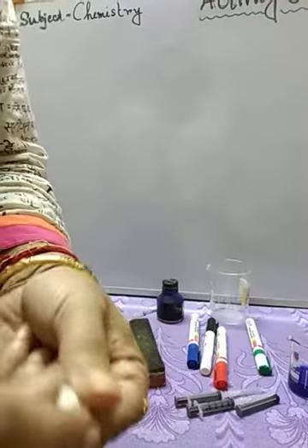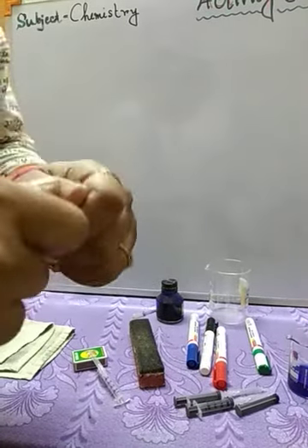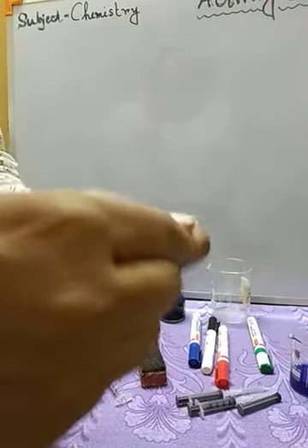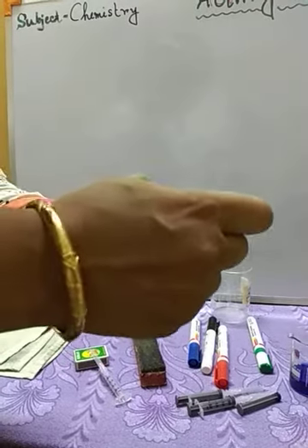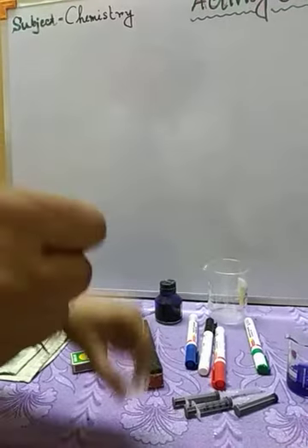I have to apply force. We need to make it into smaller pieces. So after breaking this, I'm going to put this into this syringe.